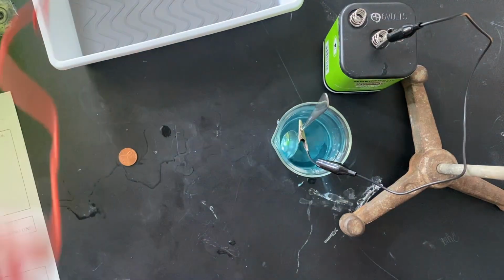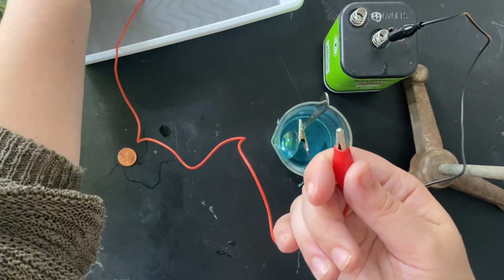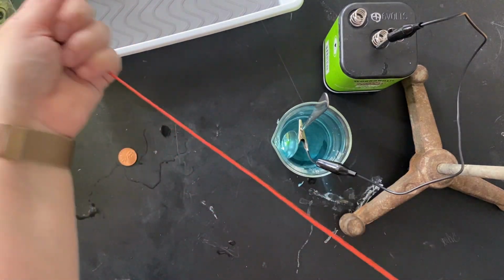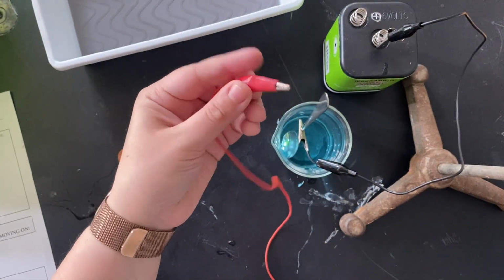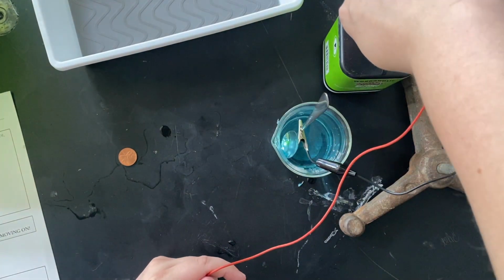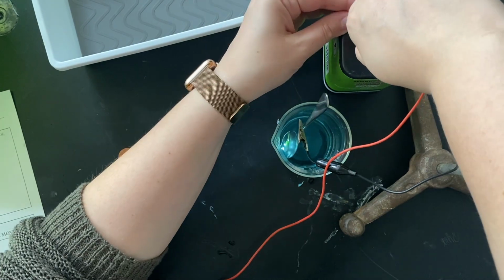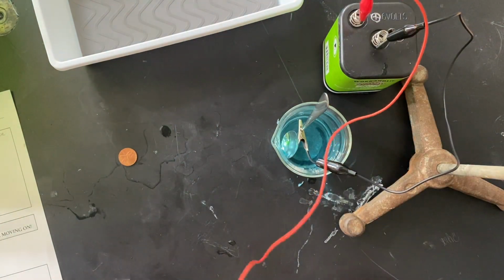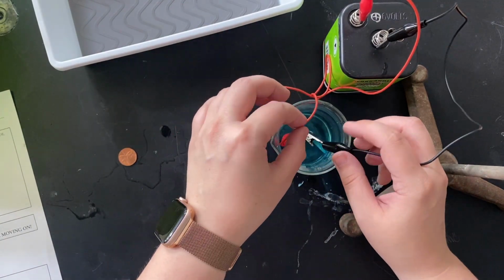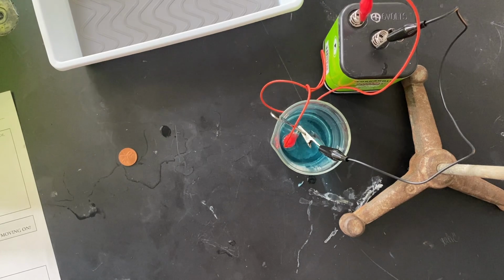Okay. Now the next part is to take one end of the red wire and clip it onto the penny, and the other end of the red wire onto your positive. Okay. And again, we're going to submerge your penny and complete the circuit. So once that's in, stuff is happening. You can look at it and get kind of closer to it. We're going to wait about 5-10 minutes and watch what happens.